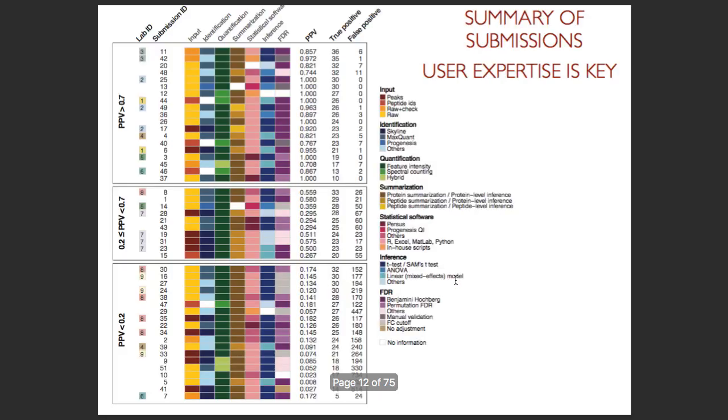Now, another thing that we did was we asked the participants to fill in a questionnaire where they had to document different steps that they did as part of their analysis. So we had here input data, the type of things they used for identification of MSMS spectra, quantification of MS1 spectra, summarized spectral features, statistical software, how they made conclusions, adjustments for multiple testing. And so Mina, who is sitting there and who will be presenting for the rest of the day, she did a lot of work putting together this figure. It was extremely difficult.